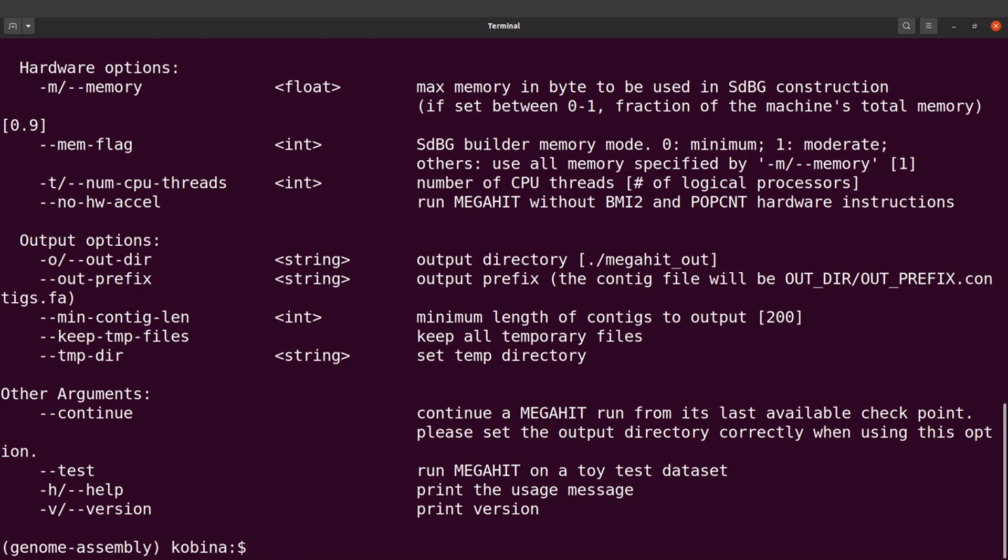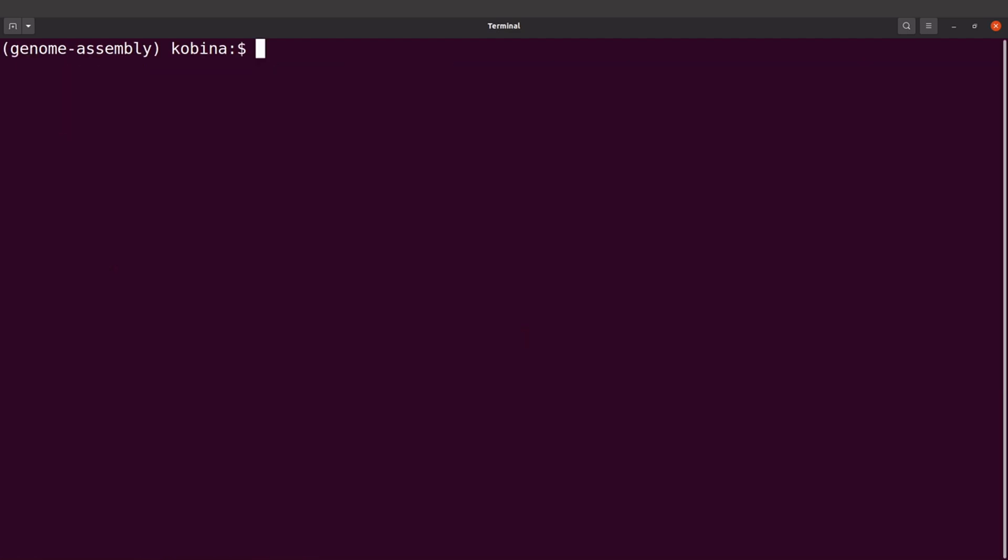If you want to deactivate the environment you can say conda deactivate and the environment will be deactivated for you. If you deactivate you will not be able to run MEGAHIT. That's how we install MEGAHIT using conda.